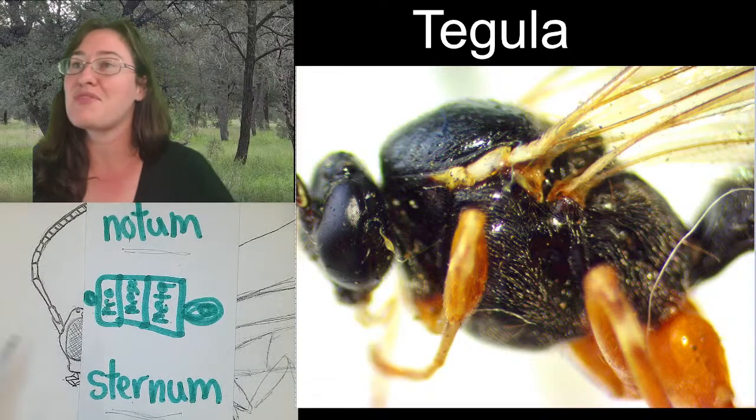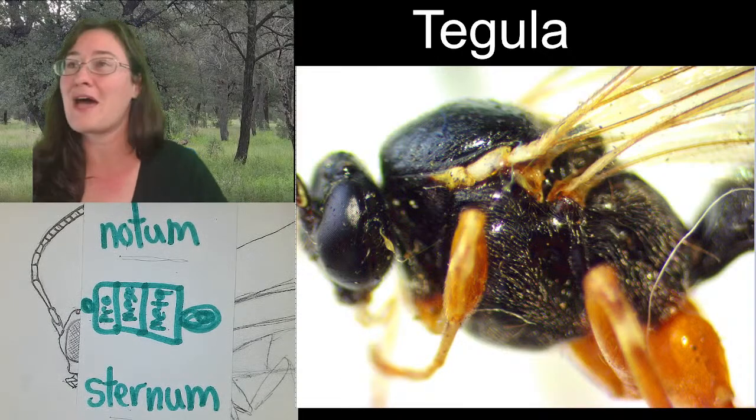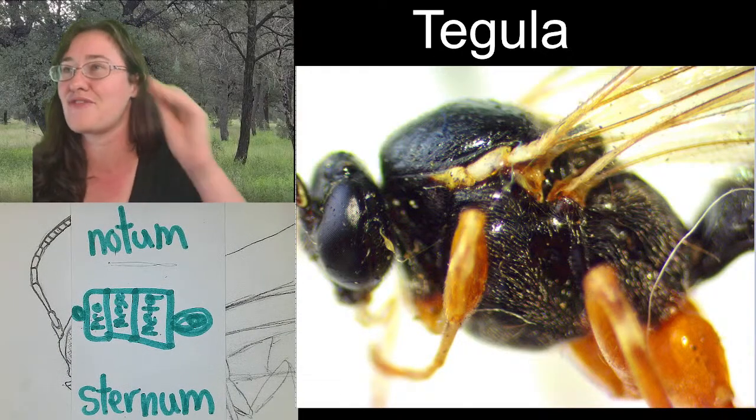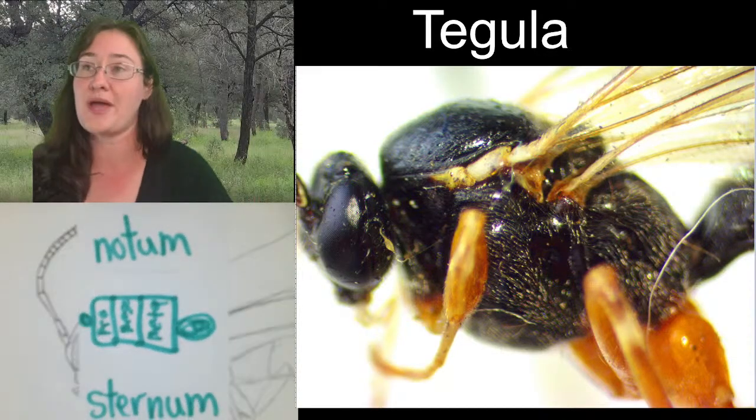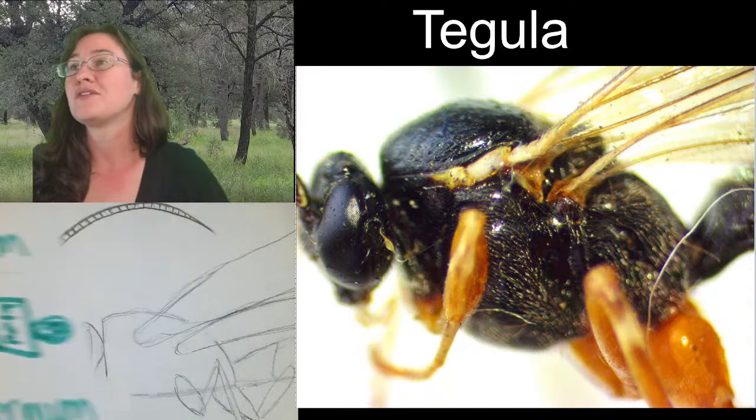So that might help you. I don't know. It helped my students kind of visualize it. And then you know where the pro leg is. It's the first one. Or the meso leg. It's the second one. Right?